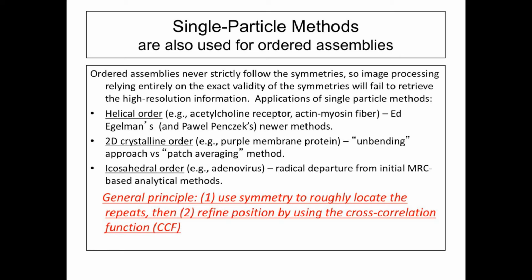So it's been true for helical order, two-dimensional crystal order, and icosahedral order. Each of these different cultures of image processing converged into the single particle method in the end.